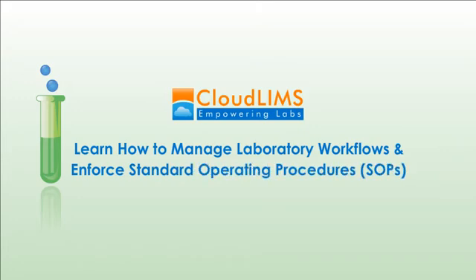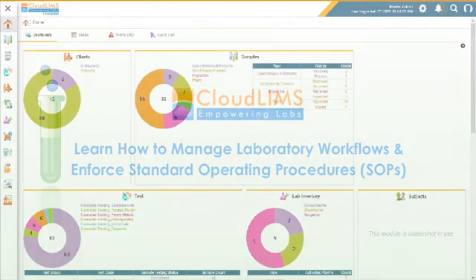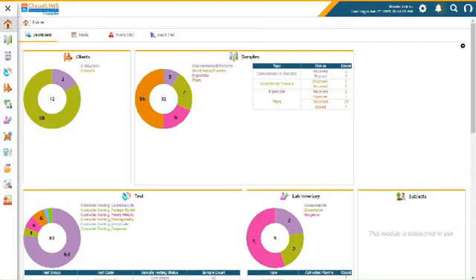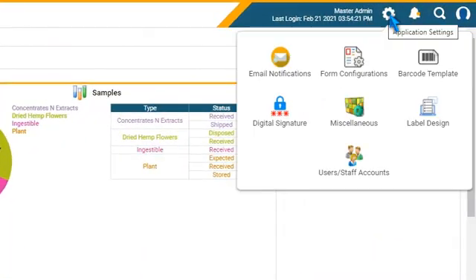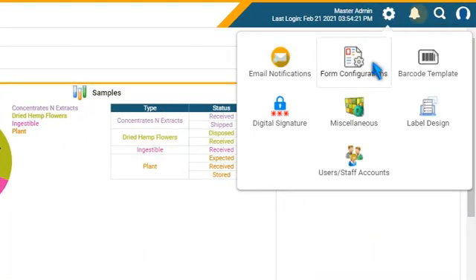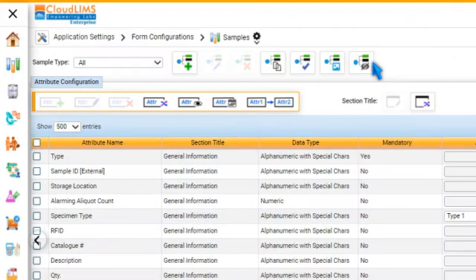To configure a workflow, navigate to the Application Settings module and switch to Form Configurations.